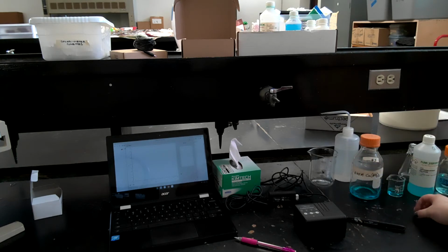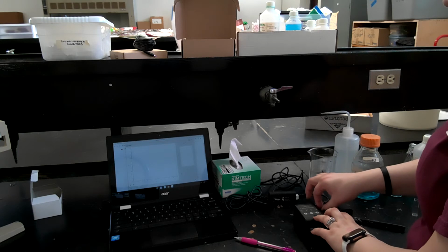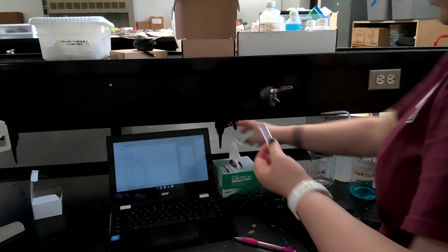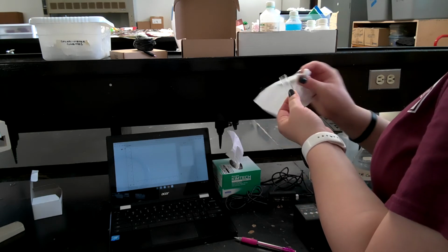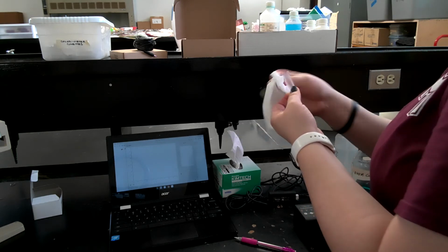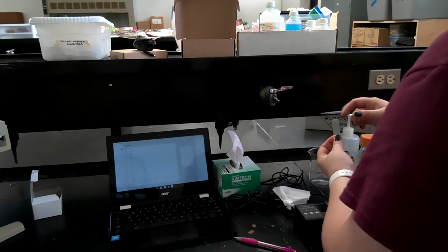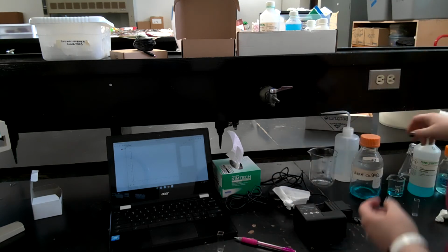So I've already calibrated with a blank cuvette. I'm going to take out the cuvette I was using before, again touching the sides with the ridges and not the clear side, and I'm going to clean the clear side as best I can. Now I'm going to gently place the cuvette down.